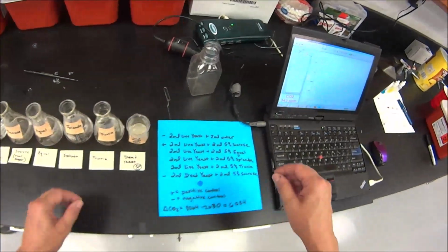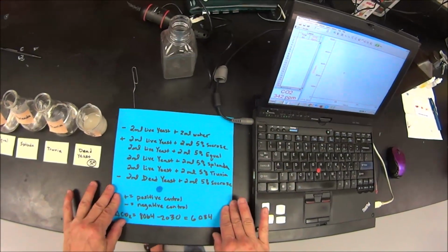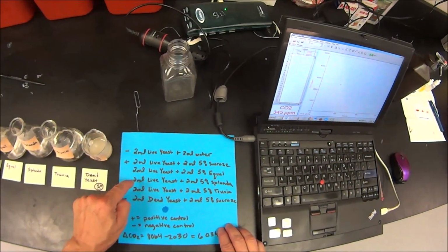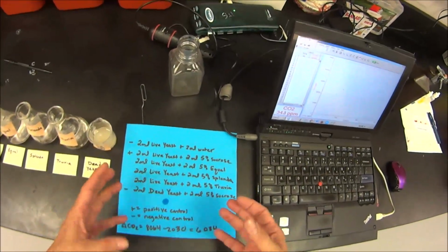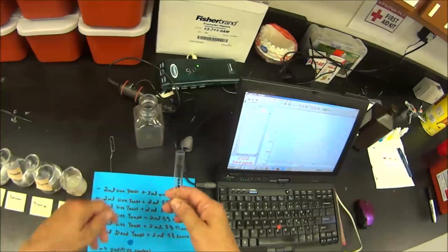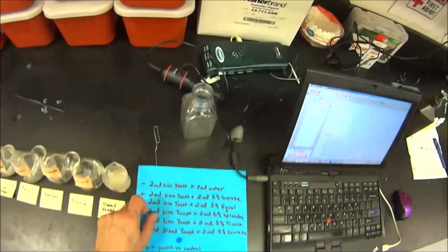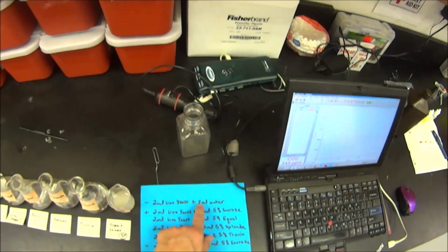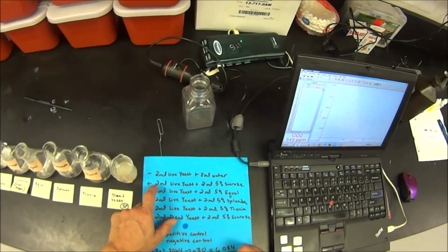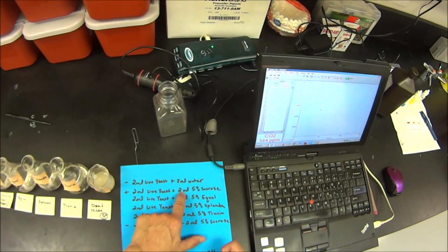Okay, now here is our experimental setup. I'm going to make 6 experimental groups. It's simply going to be, I'm going to take little test tubes and fill them. So I'm going to fill one test tube with 2 ml of live yeast and 2 ml of plain water right out of the tap. Next, I'm going to make a solution of 2 ml of live yeast and 2 ml of 5% sucrose.